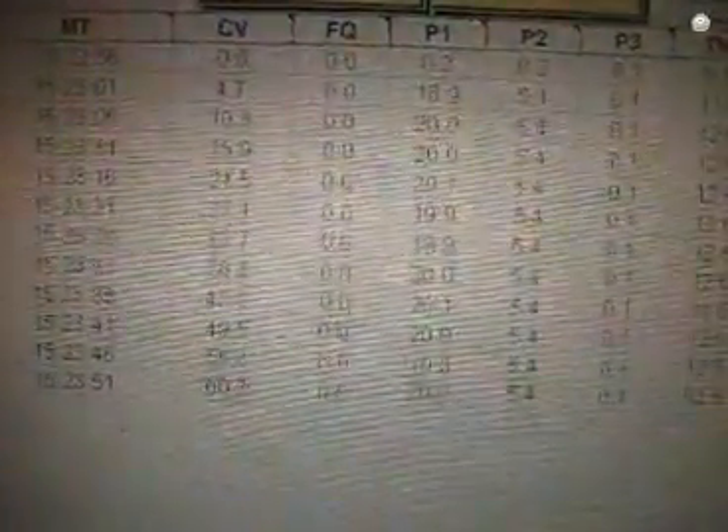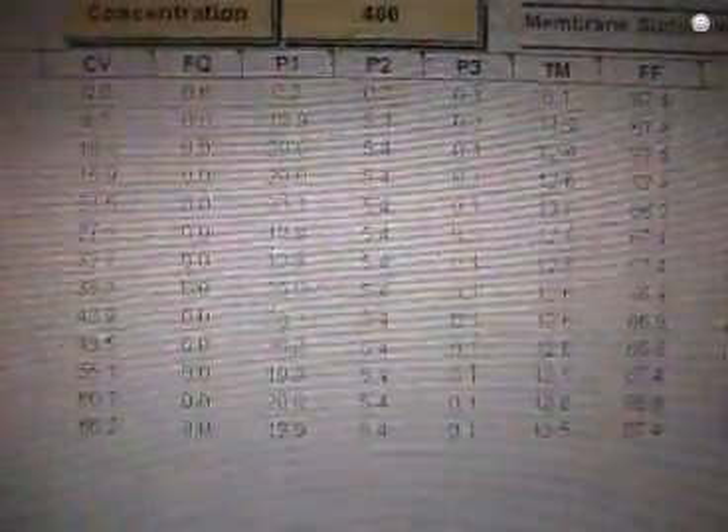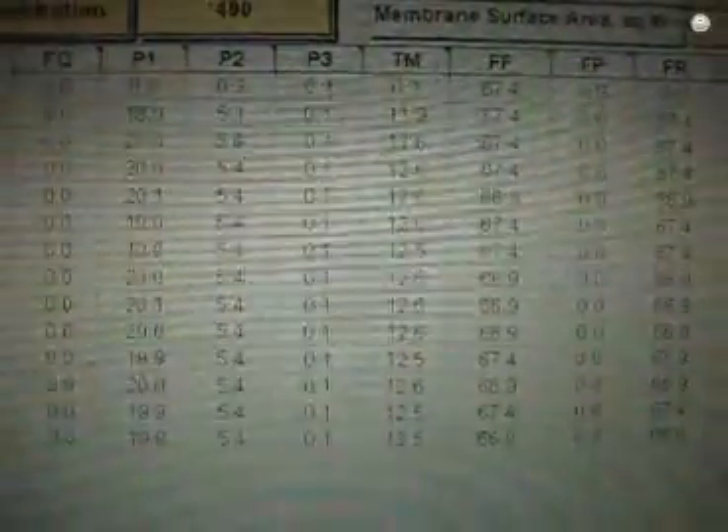We can see that PsyDoc is in fact collecting data — in this case every 5 seconds. We've got a few different parameters including Cumulative Volume, Filtrate Quantity, Pressures 1, 2, and 3, Transmembrane Pressure, and many more. So that's PsyDoc recording data for us.